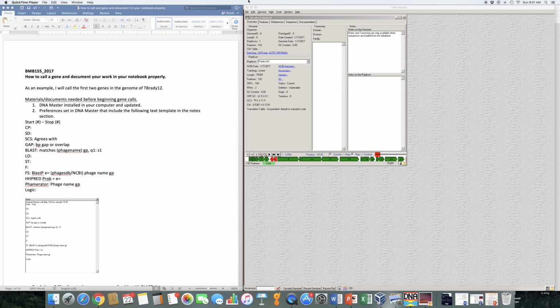In this video, I'm going to demonstrate how to call GP4, or gene product 4, of tBrady12. The materials you'll need to begin calling genes include the DNA Master program installed on your computer, and it must be updated. Your preferences must be set in DNA Master.